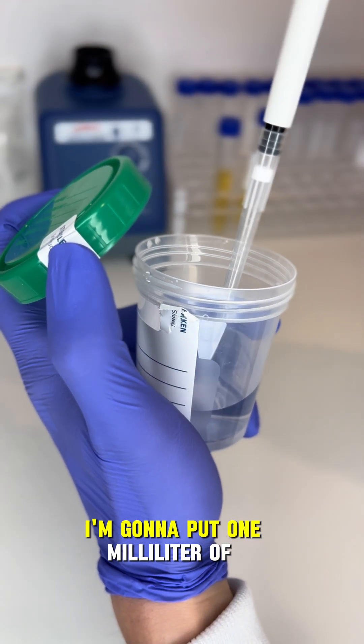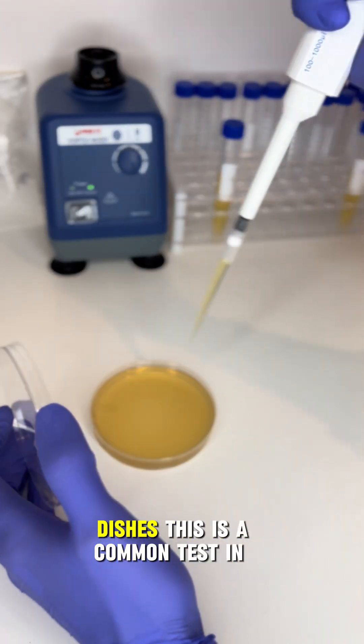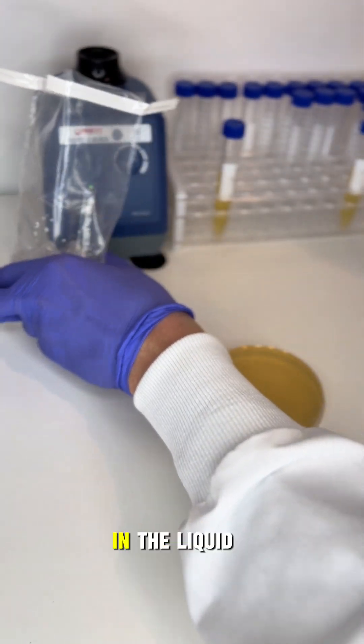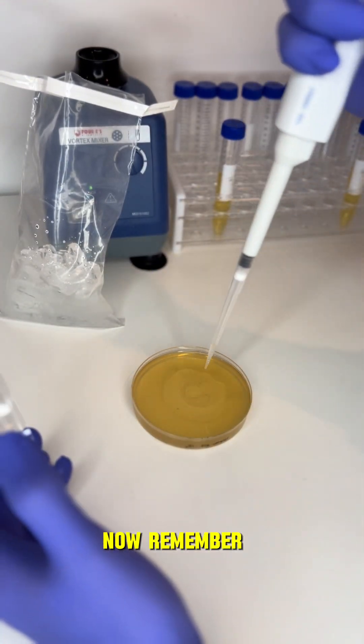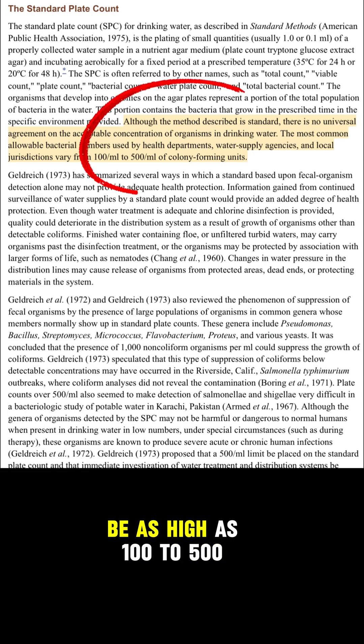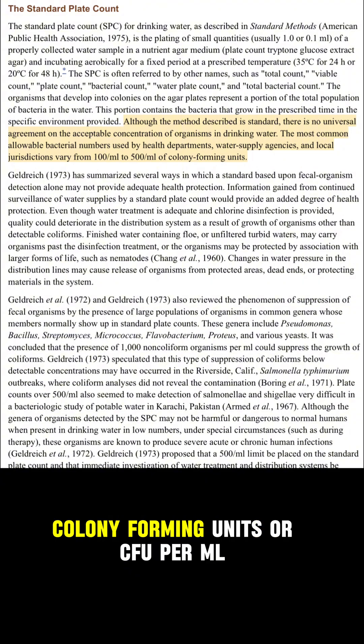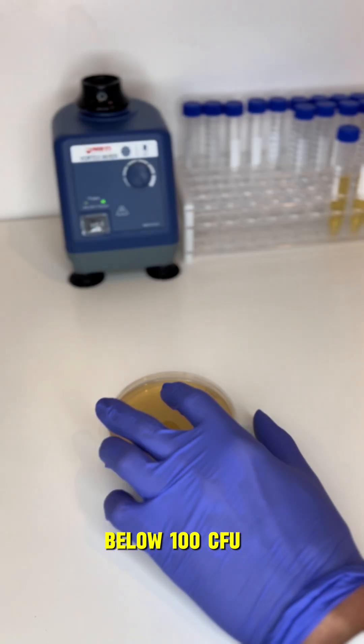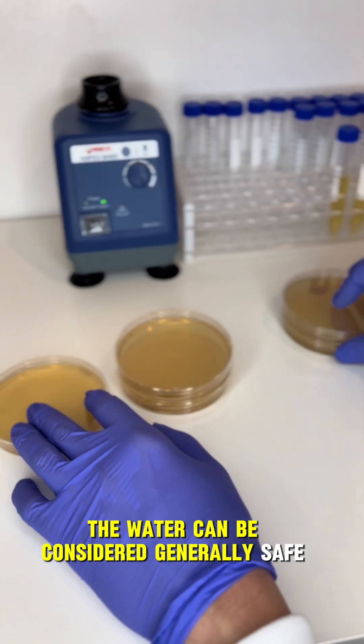In the lab, I'm going to put one milliliter of the water and ice on petri dishes. This is a common test in microbiology to determine the approximate quantity of bacteria in the liquid. A safe amount of bacteria can be as high as 100 to 500 colony forming units, or CFU, per milliliter. So we can assume that if we are below 100 CFU, the water can be considered generally safe.